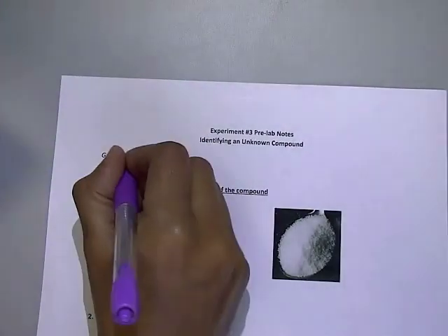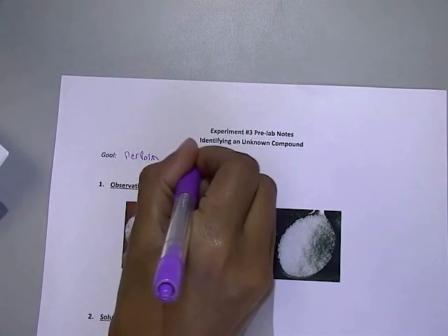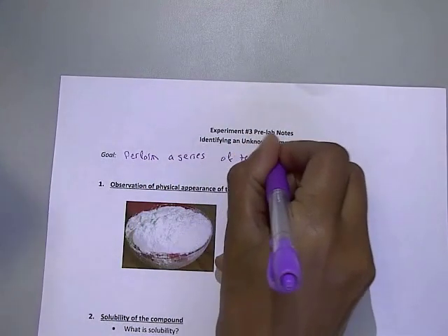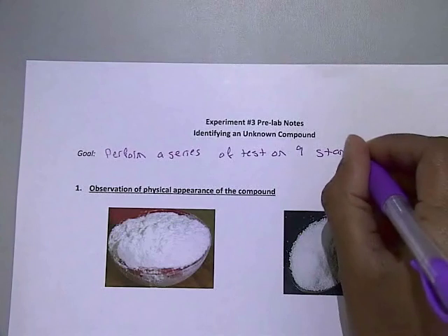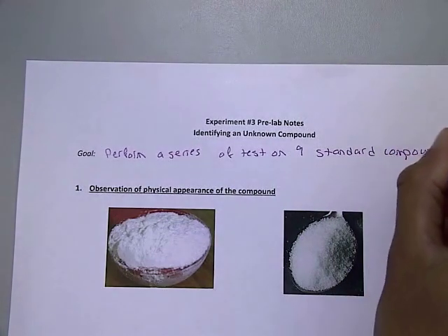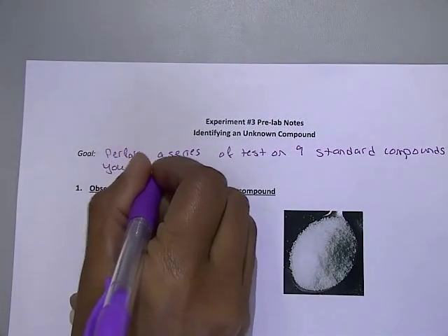The goal of this experiment is really to perform a series of tests on 9 standard compounds and also your unknown.